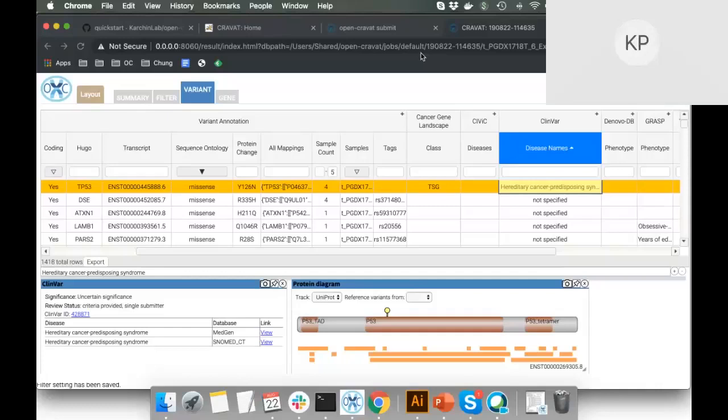After you get to a certain number of files within the same job, you should definitely consider our server version or cloud versions, which are currently under implementation. But since this is so graphically oriented, I think it's well suited to be used on a laptop. But of course, there are the command line features that I've been kind of brushing to the side because they're not as good to graphically display.